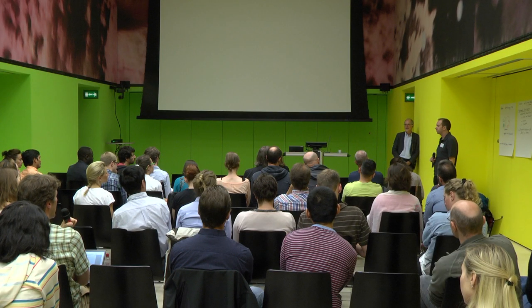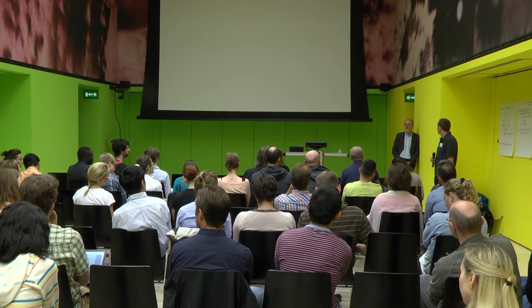Yes, I think it's eventually a question of what we define, right? The principle you isolate and you measure is old, right? As soon as you have a high resolution, if we now try to put the standard and match the best performance of the best triple, or let's say, this generation of PRM, the bar is changing, right? But the physical principle, I agree with you, is not new per se.